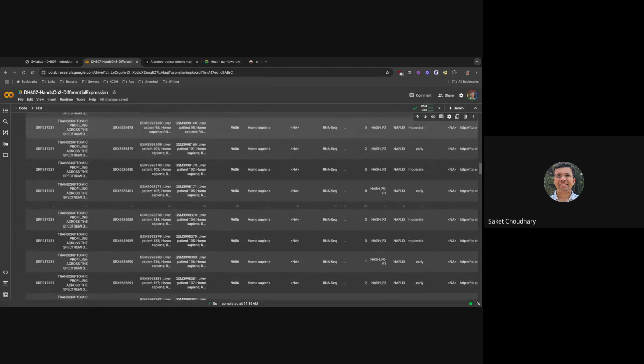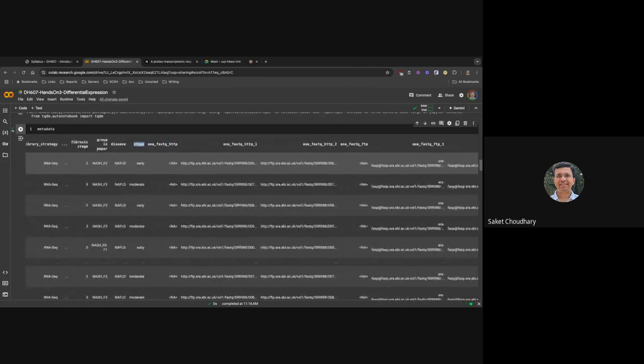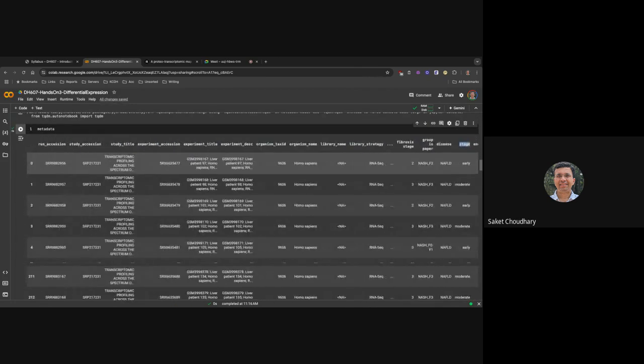You're seeing multiple things here, and multiple things are hidden. You'll see in a bit that some of this information is useful, some of it not so much.